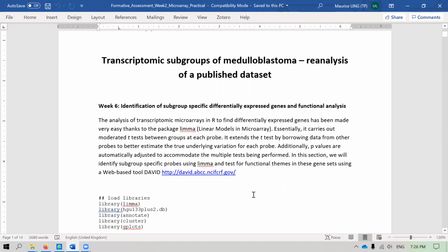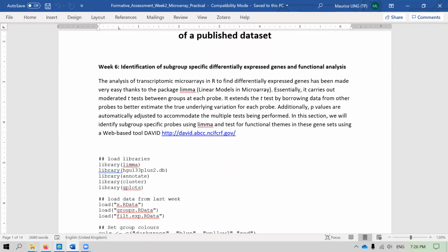At the end of the day, we are going to use gene ontology enrichment analysis. You are looking at the stage of cancer which will increase the expression of certain genes, and what biological functions they have increased. For example, it can be metalloproteinases, or degradation of extracellular matrix, and so on. So without further ado, let's start with our R session.